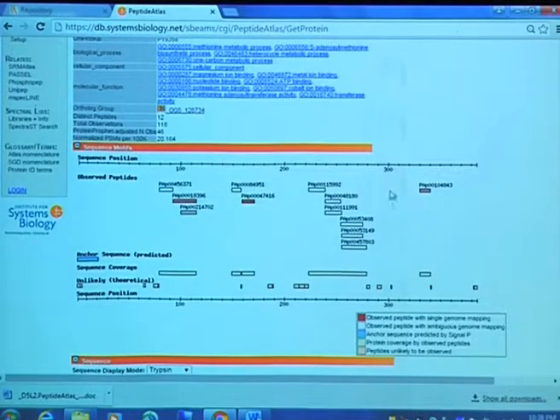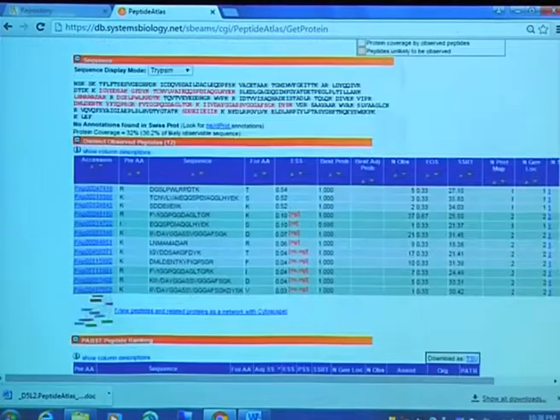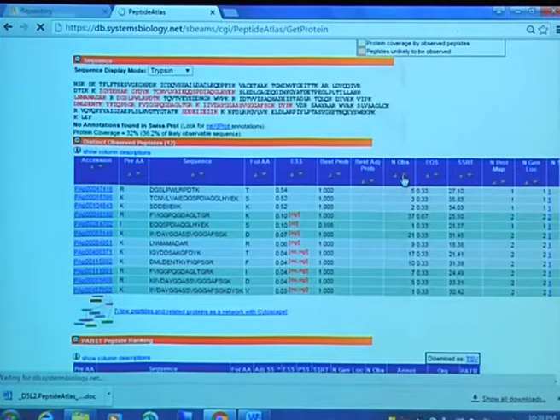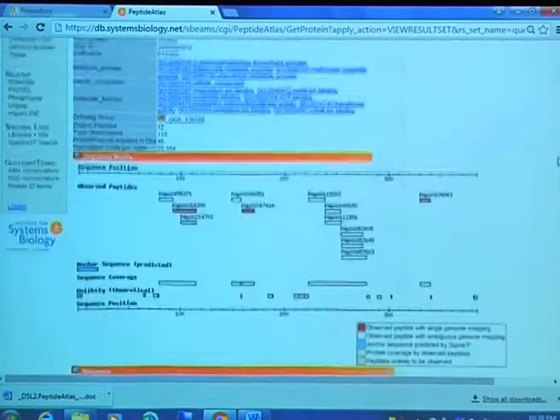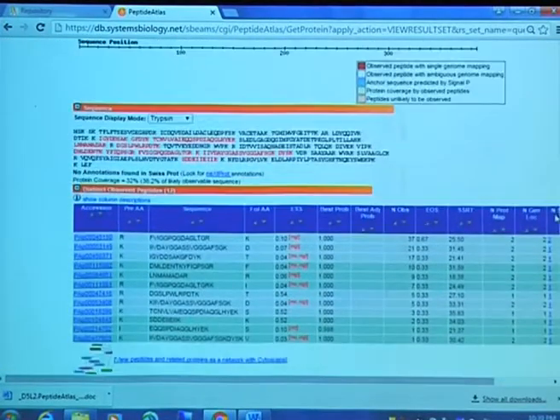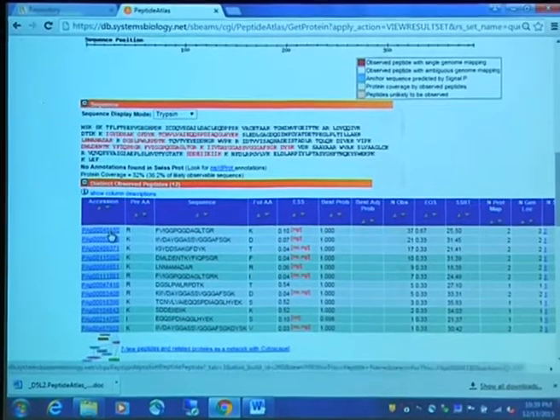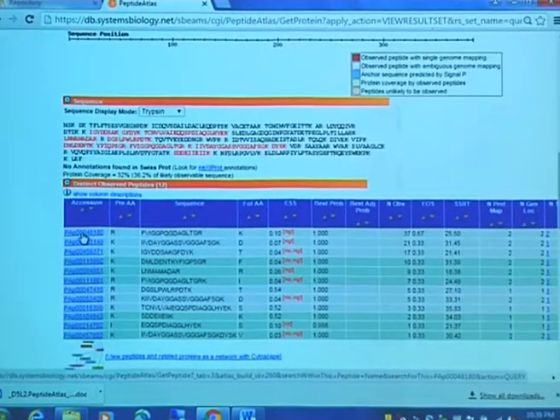And so again, this is a much more tractable number of peptides. You see there's only probably a dozen or so. And again, the ones with the most observations are sorted near the bottom. So if we sort by number of observations descending, that's the downward facing triangle. You'll see that the top hit is this FVIGG. Is that what everyone's seeing? Okay, anyway, let's go ahead and click on that particular one, the 0048180. Do people see that one?